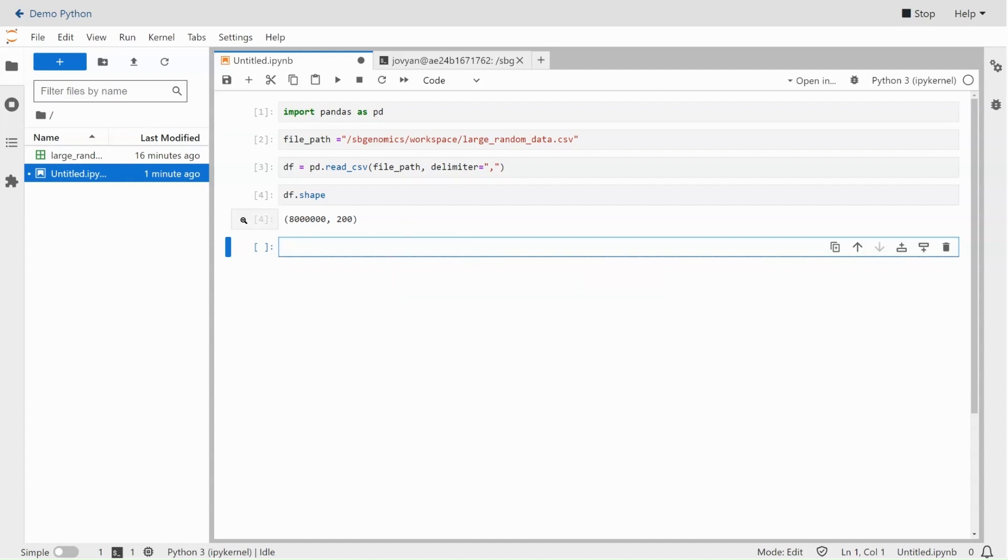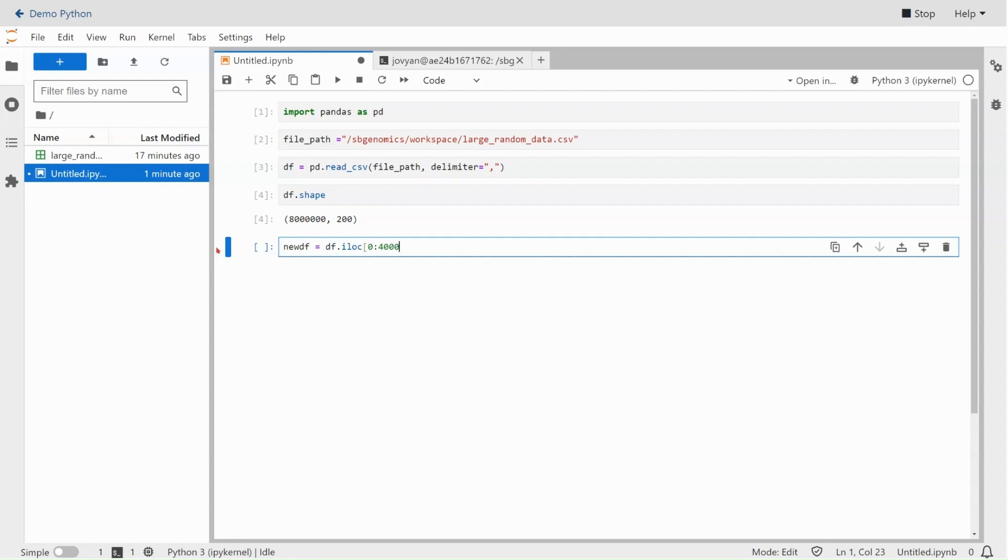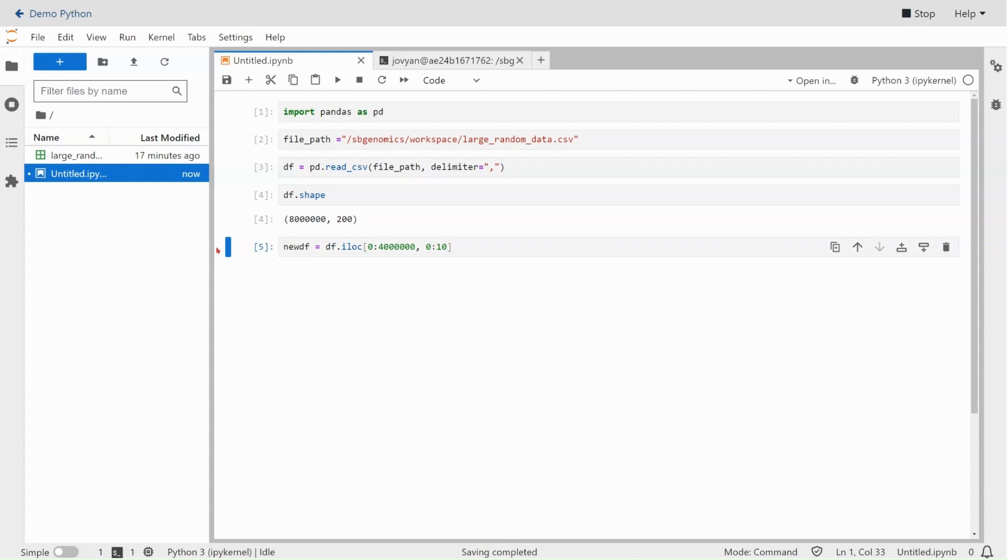And then just to modify it so that we can resave it, we'll take a slice out of it. I'll do new_df equals df.iloc indexed location. We'll take just the first 4 million rows, 1, 2, 3, 4, 5, 6, and maybe just the first 10 columns. This shouldn't take too long. In fact, it's instantaneous.